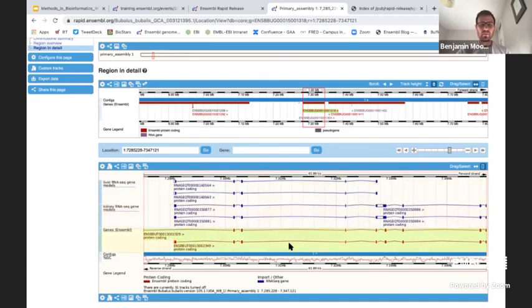So you can begin to see perhaps if there are any particular transcripts, or what some people might call isoforms or splice variants, that are expressed particularly in one tissue that they're studying, or you can compare tissues from one to the other.